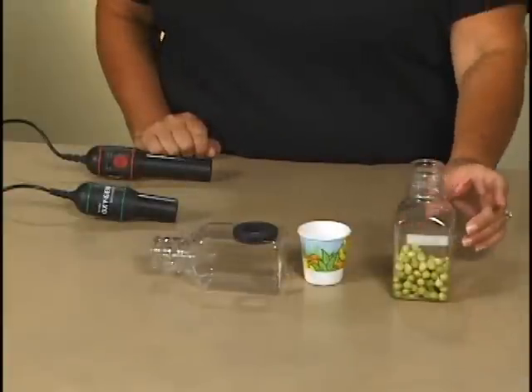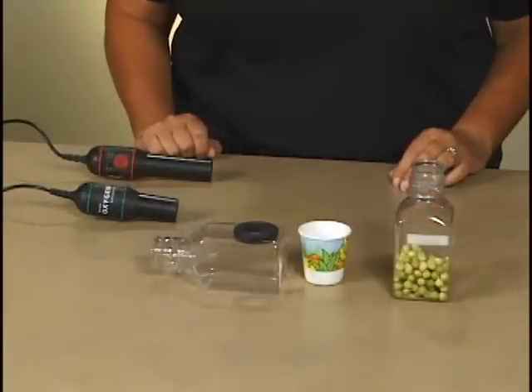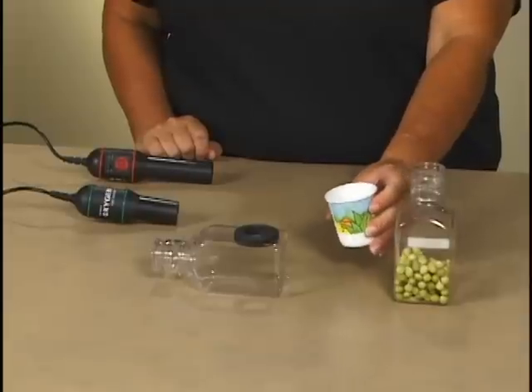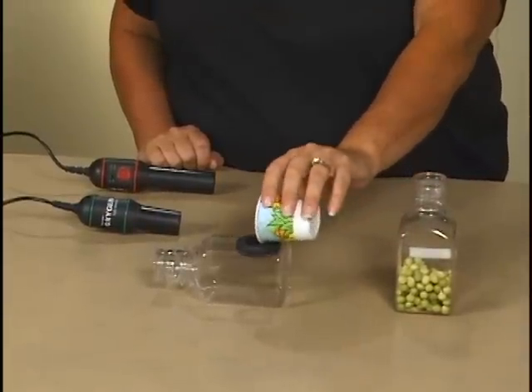I have some peas that have been soaking for a few days and have started to germinate. Measure out 20 to 25 peas and place them in the respiration chamber.